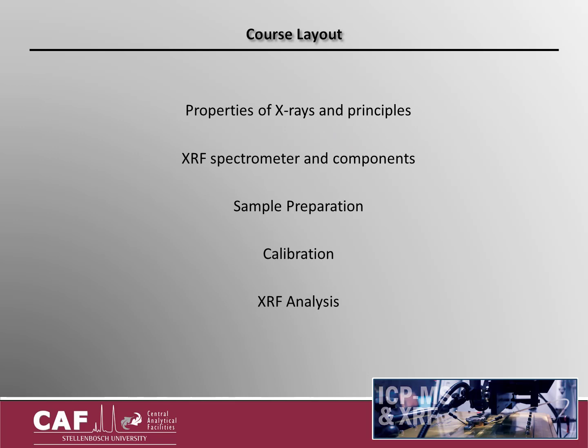Welcome to the XRF spectrometry course. During this presentation, we will cover the basic concepts of understanding XRF spectrometry. We will start with an introduction into the physical properties of X-rays and how these properties form the core principles of XRF spectrometry. Once the physics behind the XRF analysis is covered, we will investigate all the different components of the spectrometer.